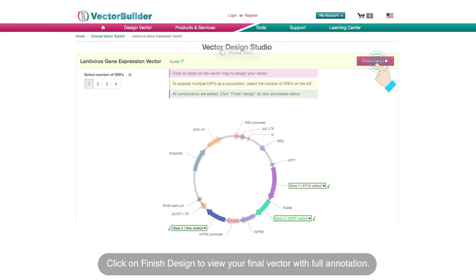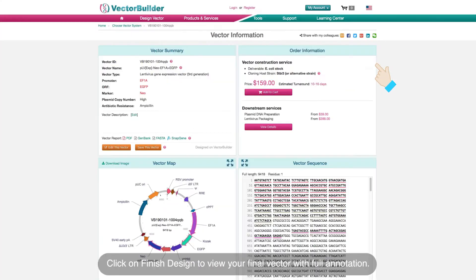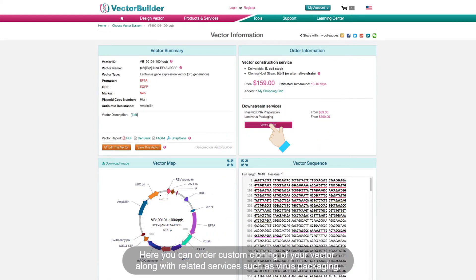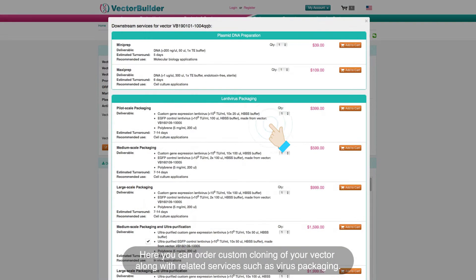Click on Finish Design to view your final vector with full annotation. Here you can order custom cloning of your vector, along with related services such as virus packaging.